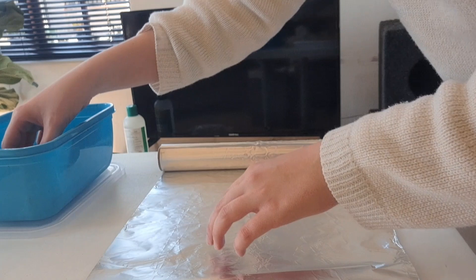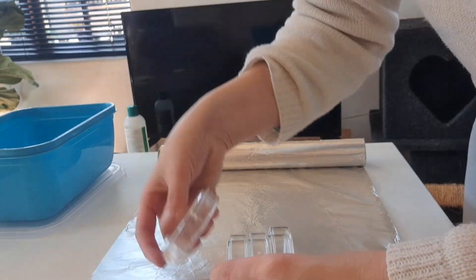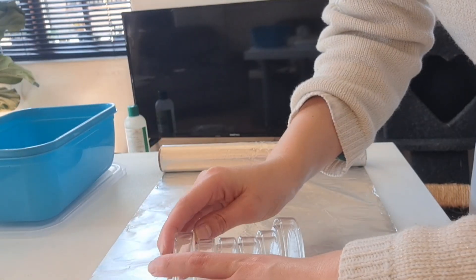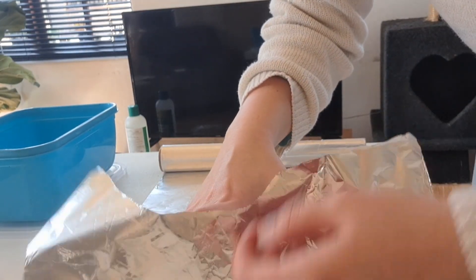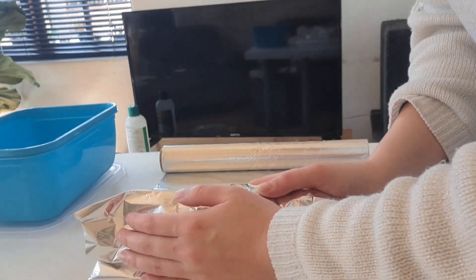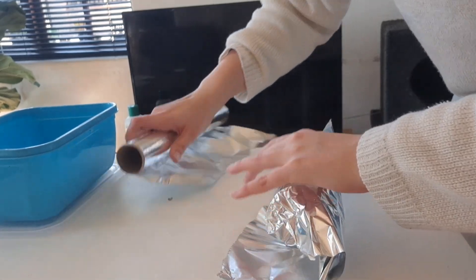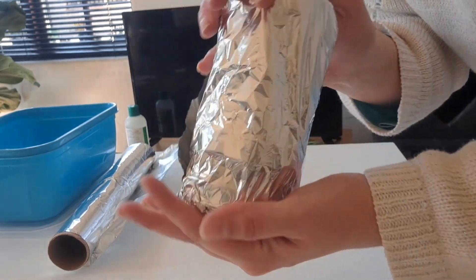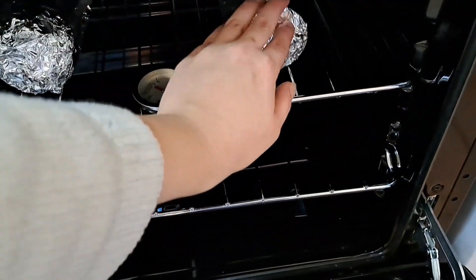First I get all my petri dishes, make sure they're clean, and stack them with the top part at the top and the bottom part at the bottom. I usually stack eight petri dishes because I can only fit eight between my thumb and middle finger, which makes it easier to work with during the agar pour. I wrap them in foil, close the edges, and put them in the oven at 200°C or 390°F for 20 minutes, then leave them in the oven to cool down until my agar is ready.